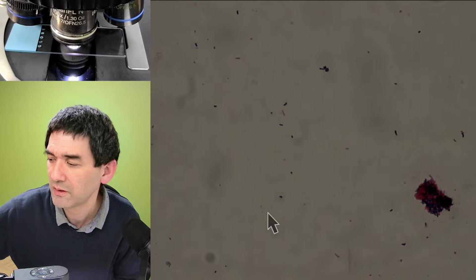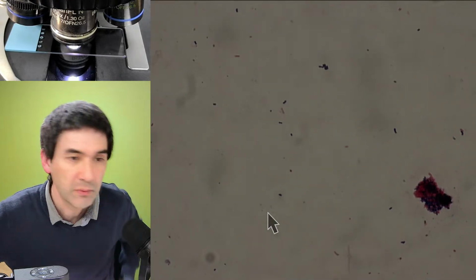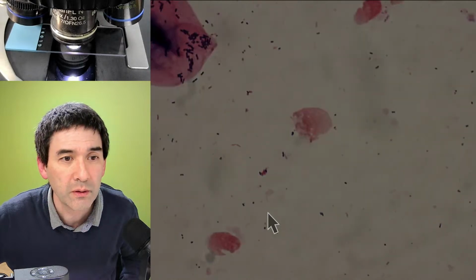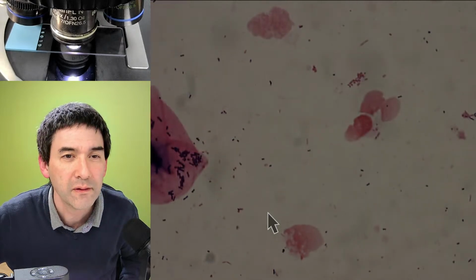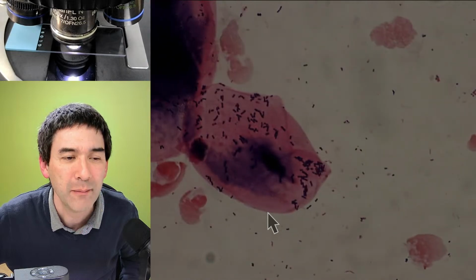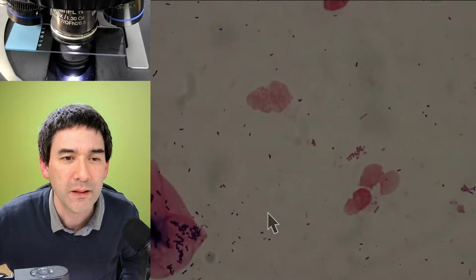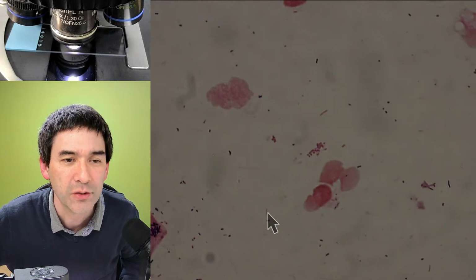Okay, let's increase the brightness here a little bit. Okay, and I don't know where. Very nice. I'm happy. I am happy. Why am I so happy? Because it worked.